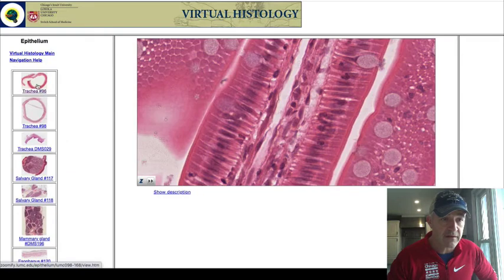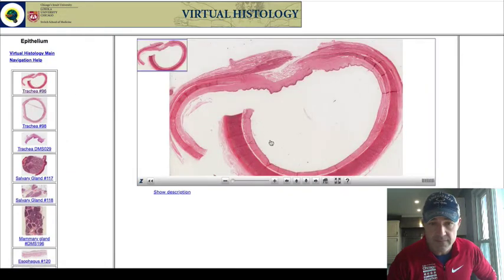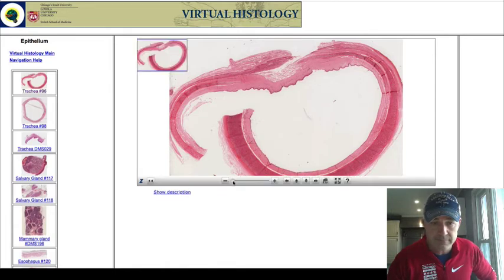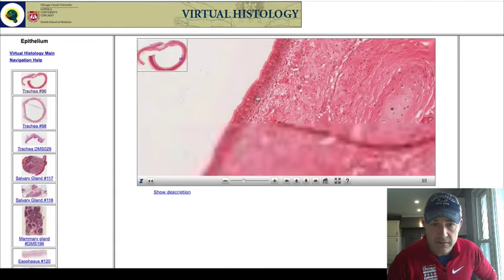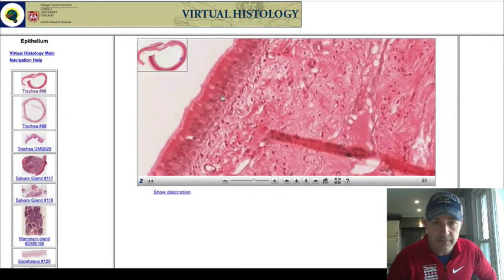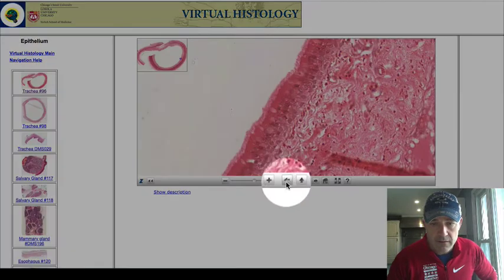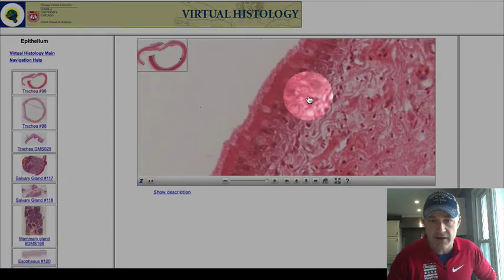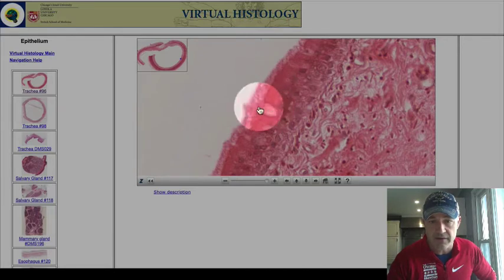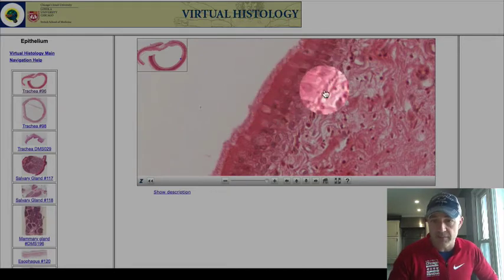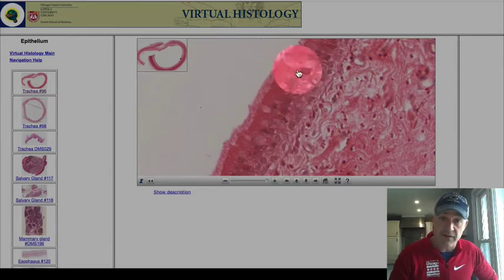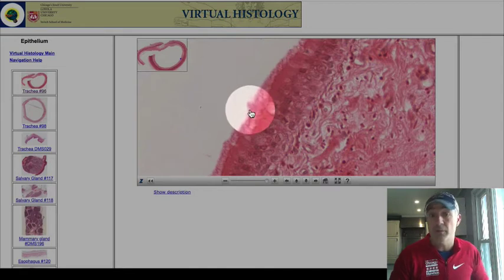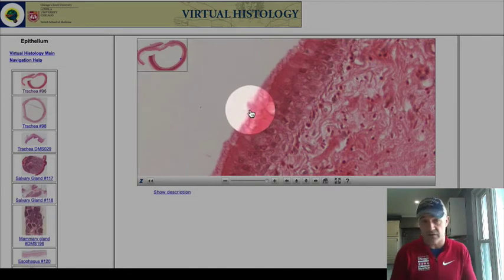Moving to the trachea slide and zooming in on the surface — you can see multiple layers of nuclei, a ciliated surface, and goblet cells interspersed. This is pseudo-stratified epithelium. The basement membrane is visible at the bottom. Not all cells reach the apical surface. This will probably be the only example I show you with cilia.